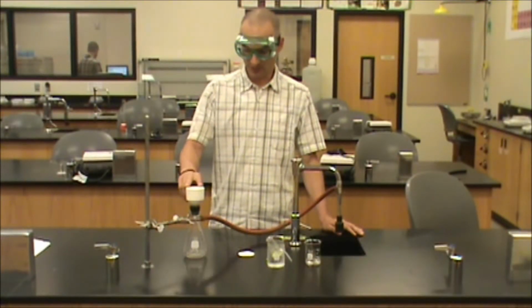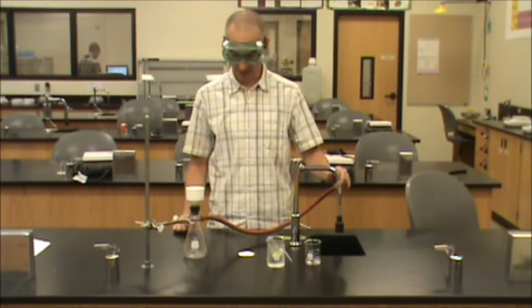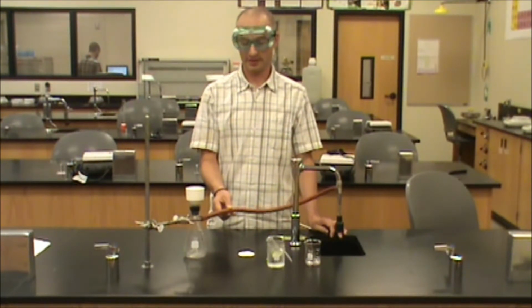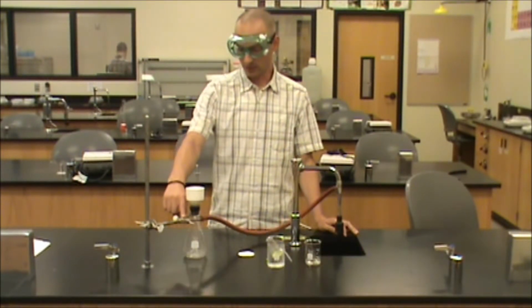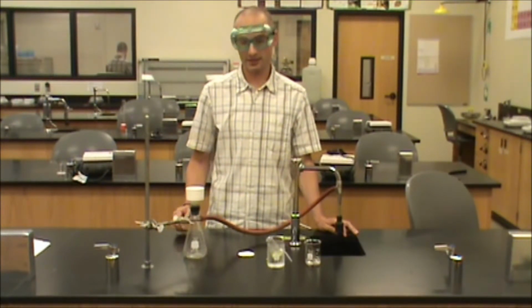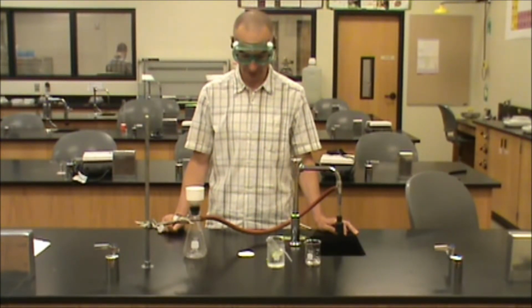I've set up a Buchner funnel on top of a sidearm flask, and I've connected the sidearm flask to the aspirator on our sink using some thick vacuum tubing. Don't use the thin latex tubing. The thin latex tubing will collapse when you apply the vacuum. Notice that I've also clamped our sidearm flask. It can tip over easily. I highly recommend that you clamp the sidearm flask to prevent it from breaking, tipping over, spilling your sample, etc.